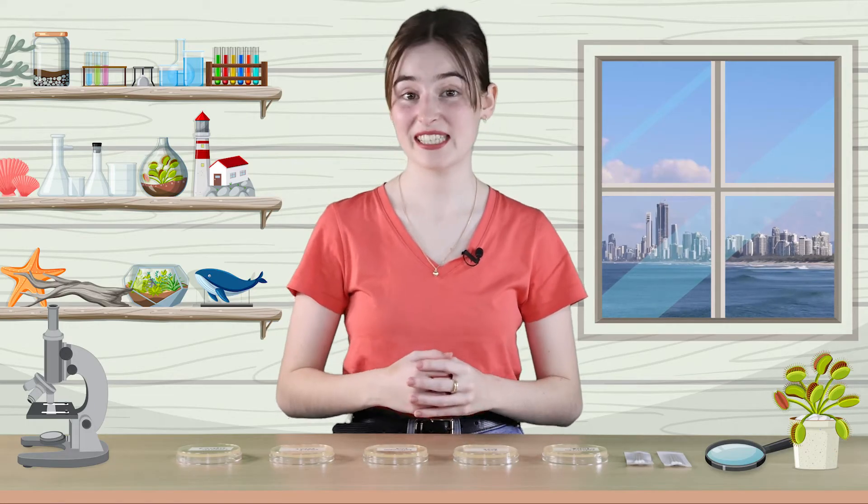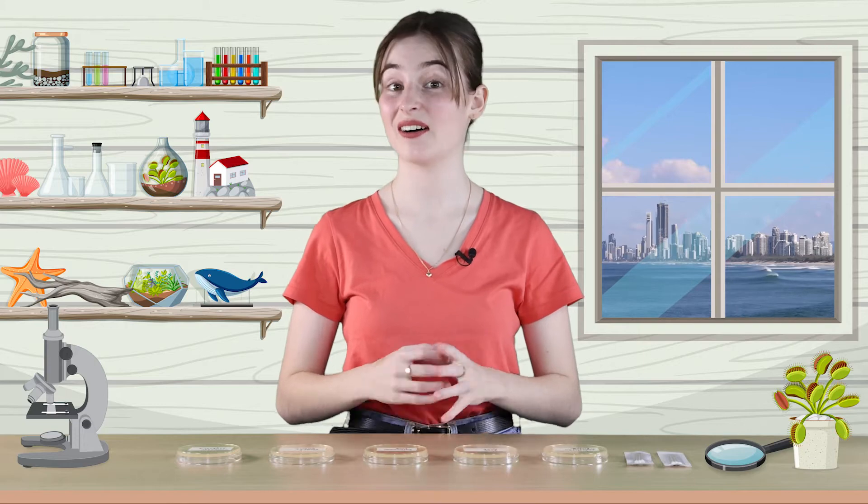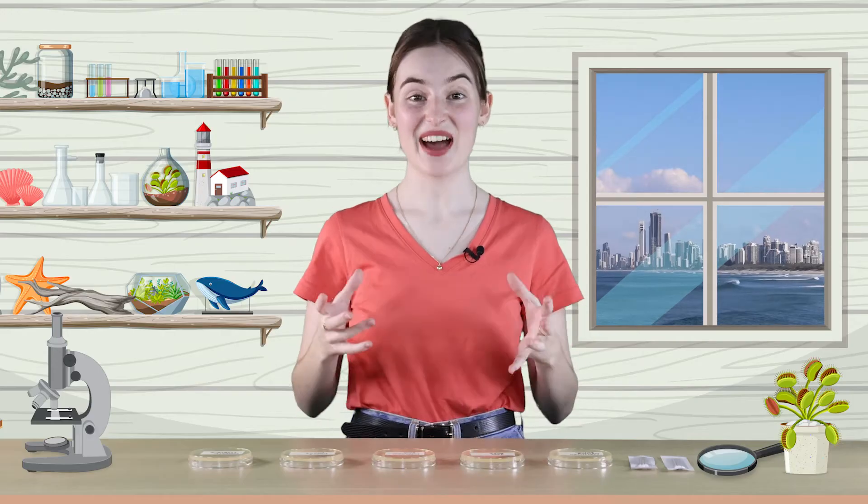Bacteria are microscopic organisms that are made up of only a single cell. They're really small. Today, we're going to take samples of bacteria on different surfaces and grow them so that they can be seen with our own eyes. Bacteria reproduce when one cell splits into two cells. Under the right conditions, this can happen in a matter of minutes. One bacterium can multiply into billions of bacteria in a matter of hours.